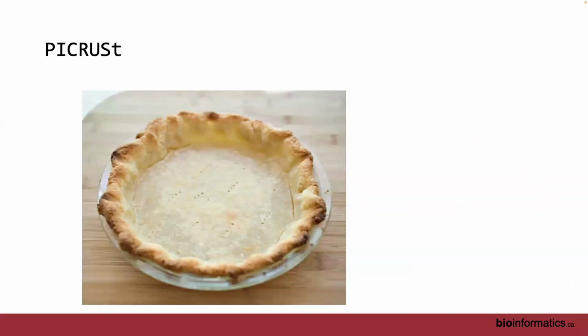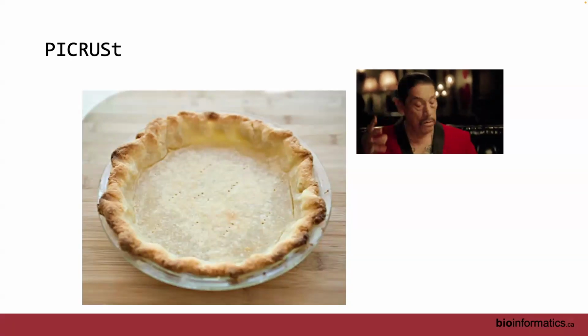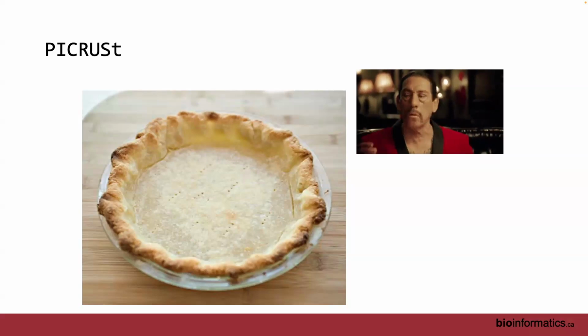Okay, so PICRUSt, yeah, it's an acquired taste. Some people love the tool, and some people love the pastry. It's been widely used, I think it's been cited about 15,000 times. It is a widely known tool because you can imagine it's quite nice: you have 16S data and then you can predict functions.